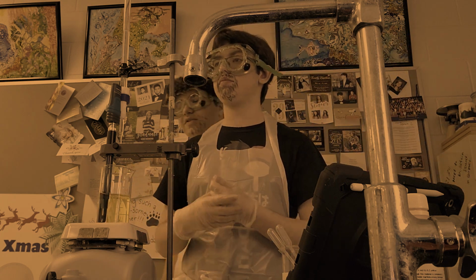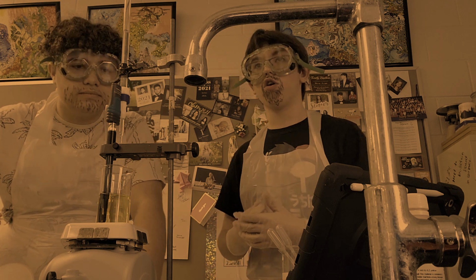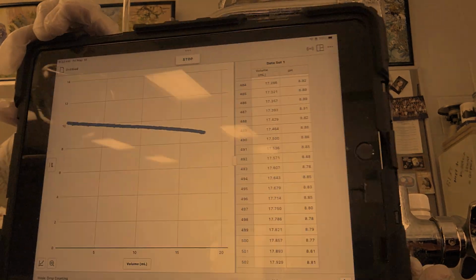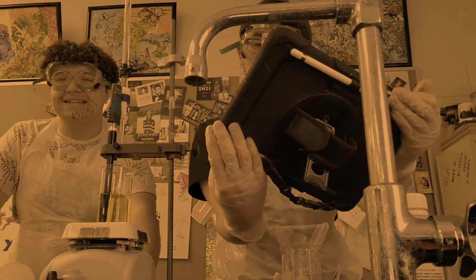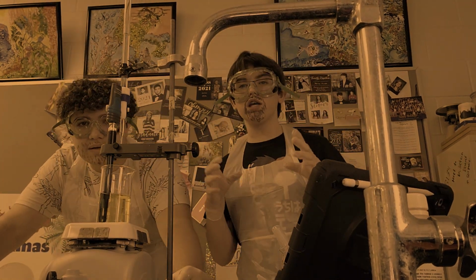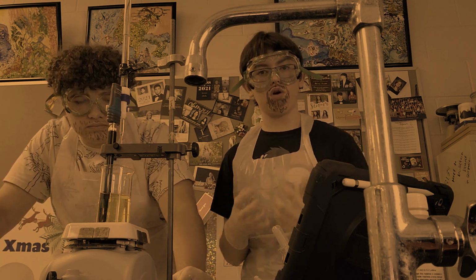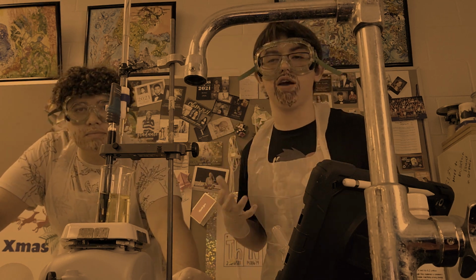I'm the best mathematician in all of New Mexico, Mr. White. And so, what we know, Jesse, is that this substance will be able to reach its equivalence point sometime soon. I can see what the pH is currently. The pH is currently roughly 8.8. That is the hypothesized pH at our 3/4 equivalence point. What we can gather from this is that we underestimated our equivalence point in our calculations. We are roughly at what our 3/4 equivalence point would be, so there must have been some kind of statistical deviation. Maybe a percent error, some may say, in our calculations.